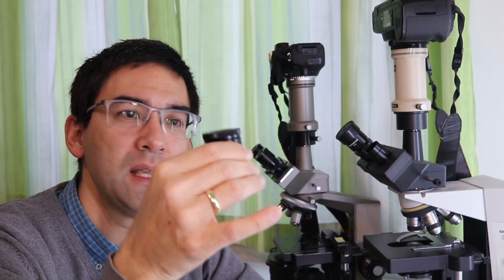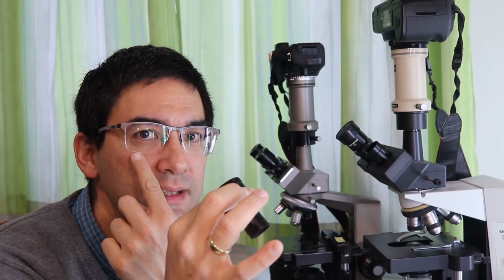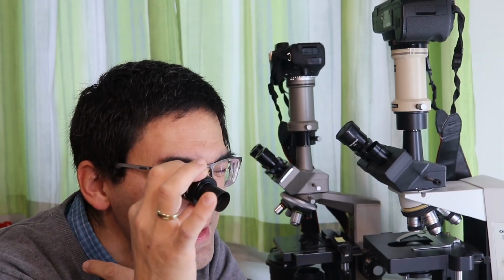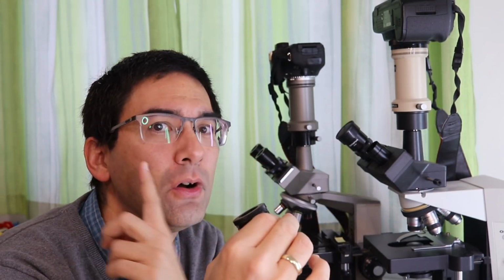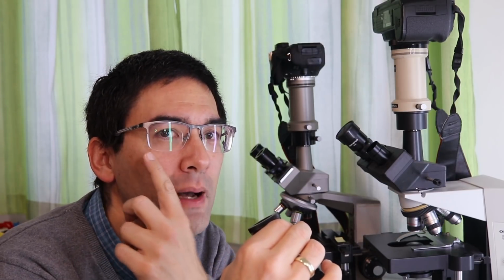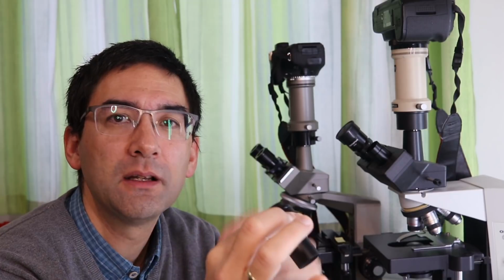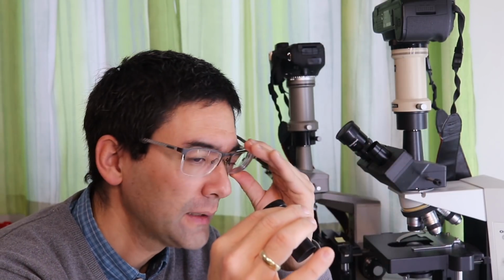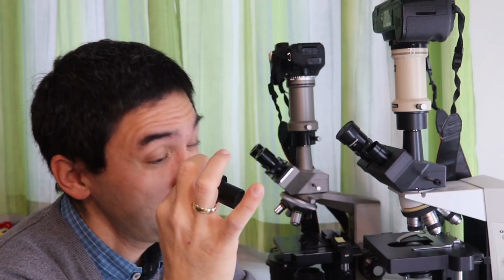Because then I simply put it in like this, and then my eyeglasses are able to now set the distance between the eyepiece and my eye. So I have already the correct eye relief adjusted because my eyeglasses are further away from my eyes, and they kind of keep the distance, okay? And if I basically want to look at the image without my glasses, then I have to make sure that there's got to be some kind of a distance.